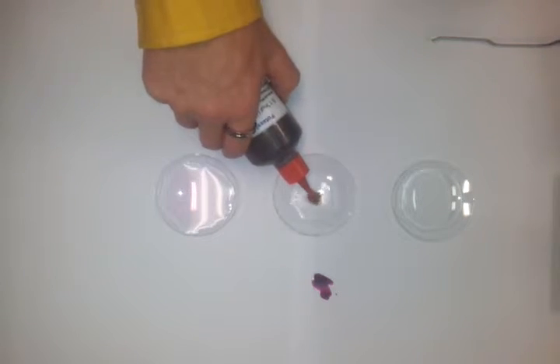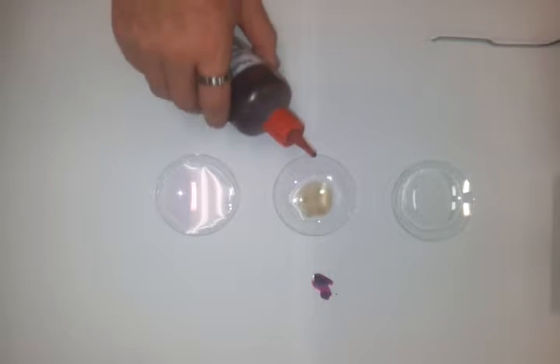If I do it without the acid, then I get quite a different response. You can see that there's a brown solid being formed. You can see the bubbles this time, it's actually reacting a bit quicker. And that brown solid is manganese dioxide.